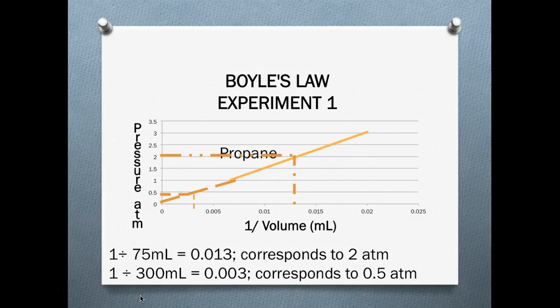So continuing where we left off, we were looking at that plot for experiment 1 with the propane, and you will see something very similar. Now when you are doing this plot, you will be using the graphical function, and I think I mentioned that when we were discussing lab 3 about density, where plotting the graph was optional, but I showed you what the graphical function is in Late Night Labs.